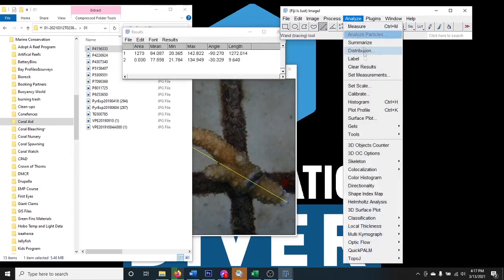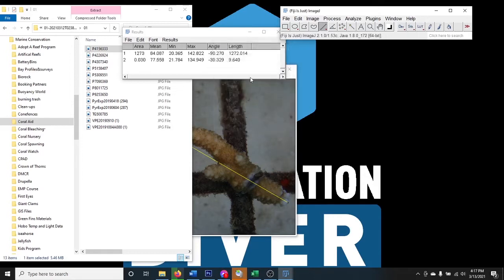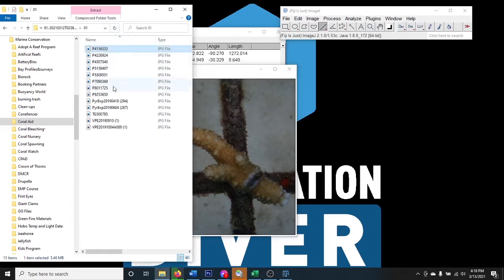When measuring the next coral, ensure you measure along the same axis and set the scale again. If you were using a microscope you could check the Global box when setting scale to apply it to all open photos, since the focal length doesn't change. However, with underwater photographs, every photo will be at a different distance from the object, so we always need to reset the scale.